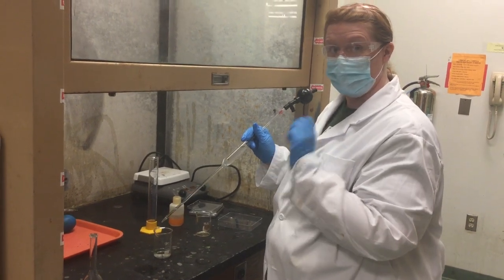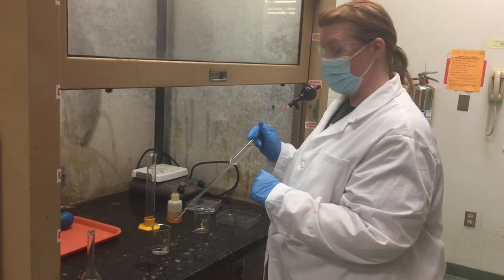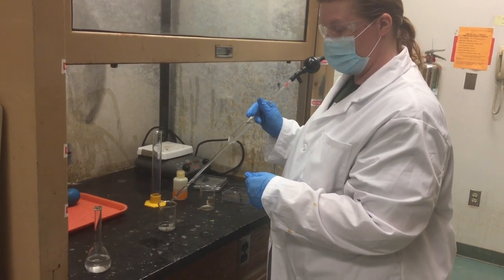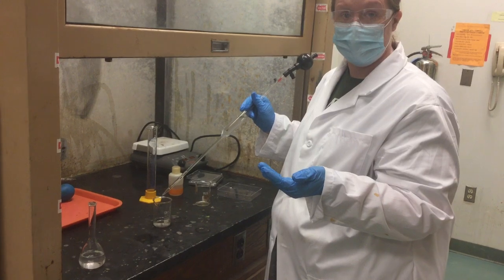I can't emphasize this enough — you've got to label things. You're going to take the pH of all six of those solutions, and then you can dispose of everything down the sink with large amounts of water.